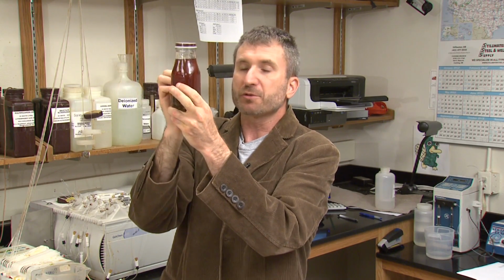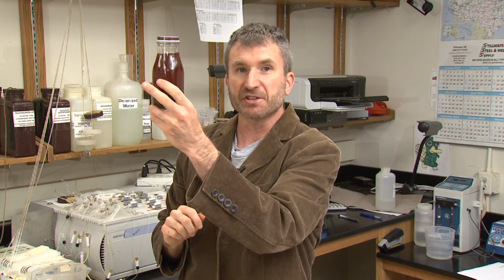That light is going through the bottle, and some of it is being absorbed by the tea, and some is traveling to hit your eye, the receiver. So there's an emitter, a receiver, and something in between that's going to absorb some of the light. Well, that's how this machine works.